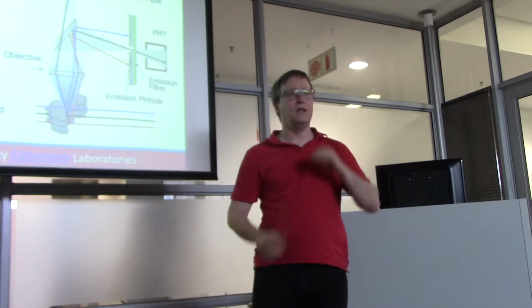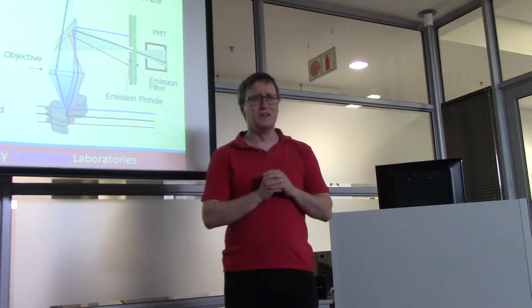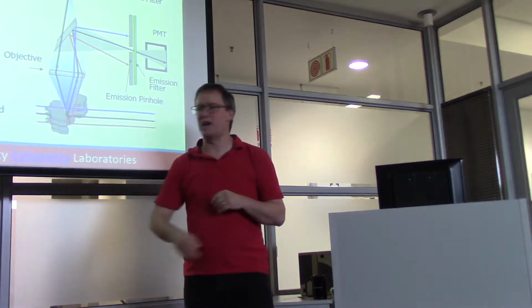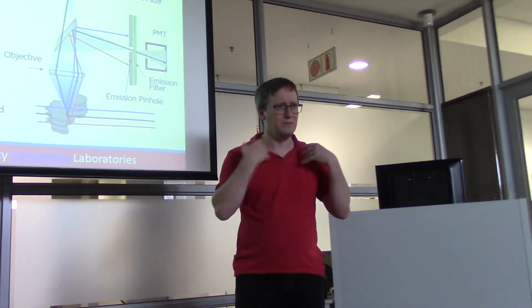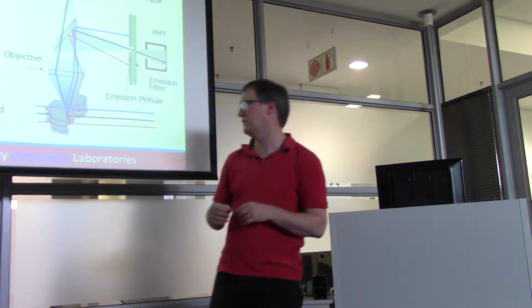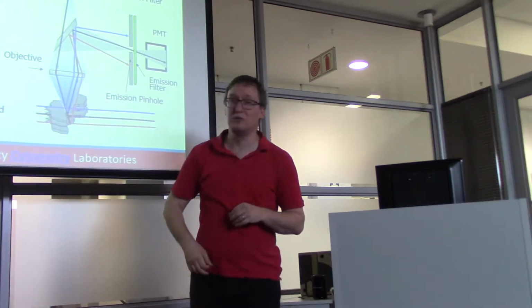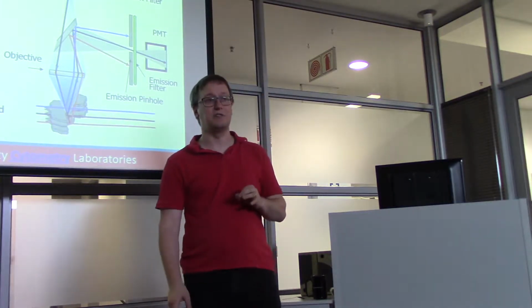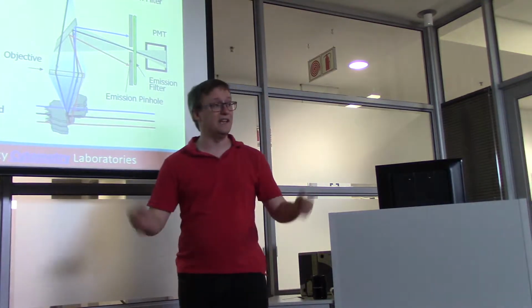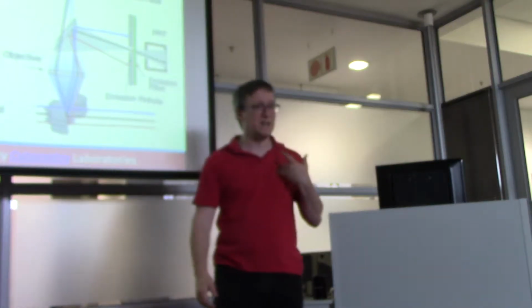Okay. So if you spent time looking through a microscope in your cell biology class as an undergraduate, you probably had an instrument rather like the one on the left. We have the sample down at the bottom. We have some sort of light source that's sending light to it. Light is reflecting from that or is being transmitted through the sample, depending how thin it is. It hits an objective lens, passes through some other optics. It comes to an ocular lens, and that ocular lens is closest to your eye, and your eye then serves as a detector. So we have a light source, we have reflected or transmitted light that is then passing through optics being detected by your eye.